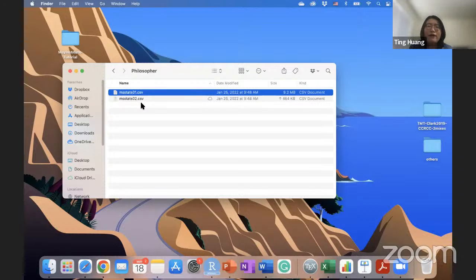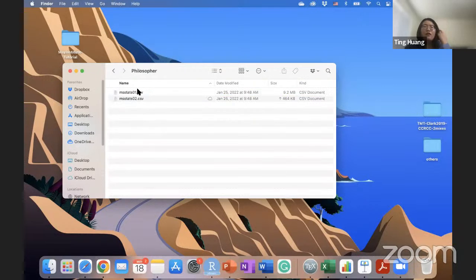We collaborated with FragPipe, and if you run FragPipe, you will see there is a button to generate MSstats output. So that's how you get the file. When you run FragPipe and click the button, generate MSstats output, it will give you the MSstats format output. So here are the two files. Okay, that's how we get the output from Philosopher. I will also explain, for other tools, what input data file we need.